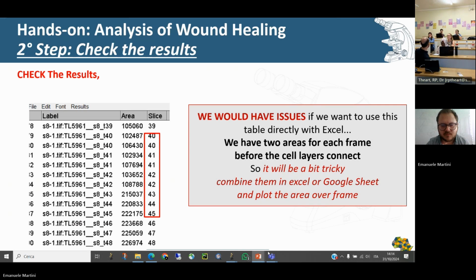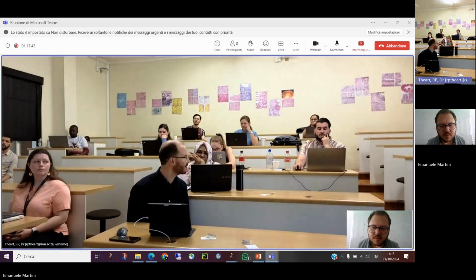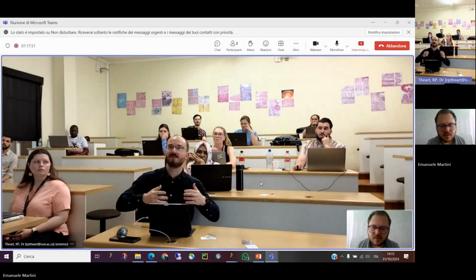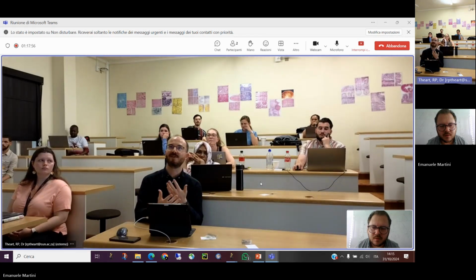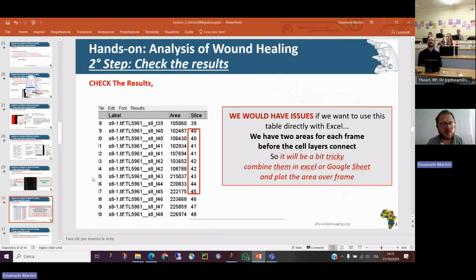Yeah, so just to say, it seems like also an issue that's coming up for at least some people is that when the areas are extracted, the labels of where it's found the segmentation just show all of those labels on every single slide. We can fix it soon.